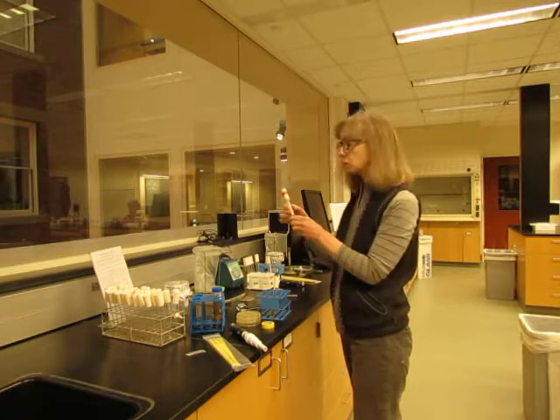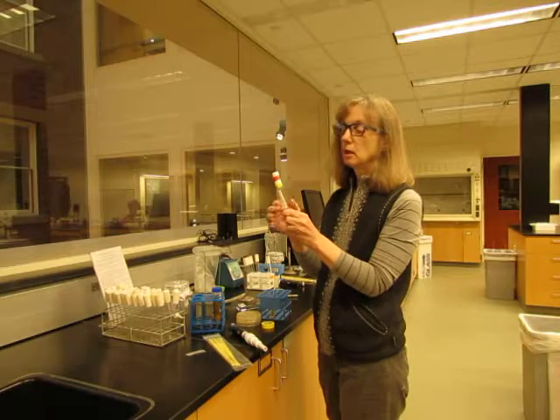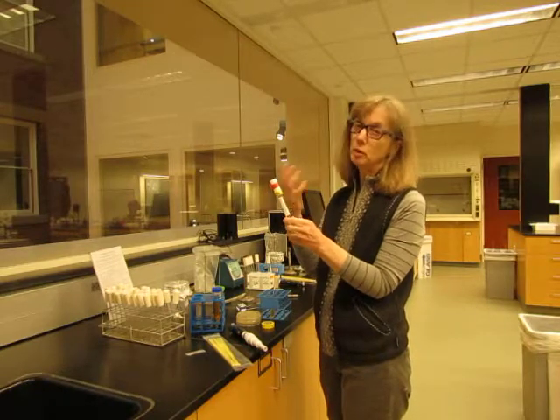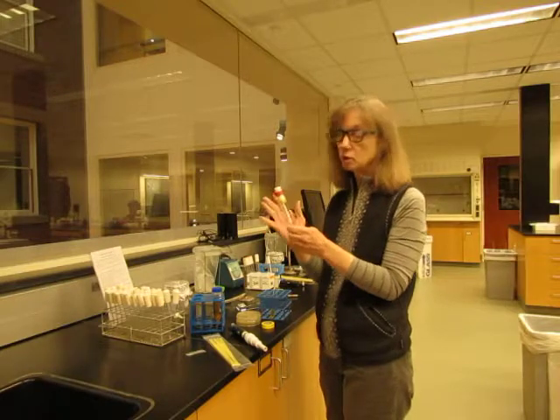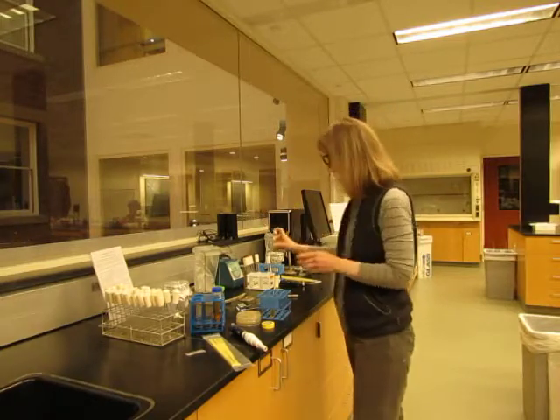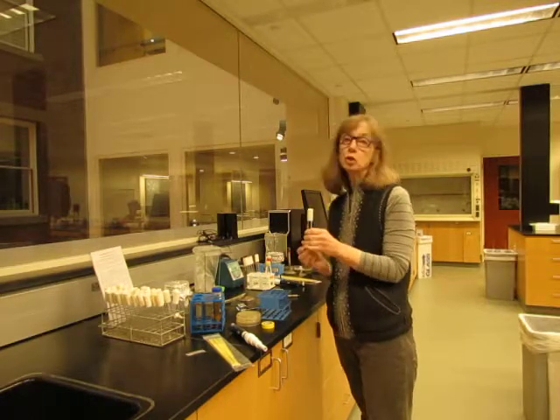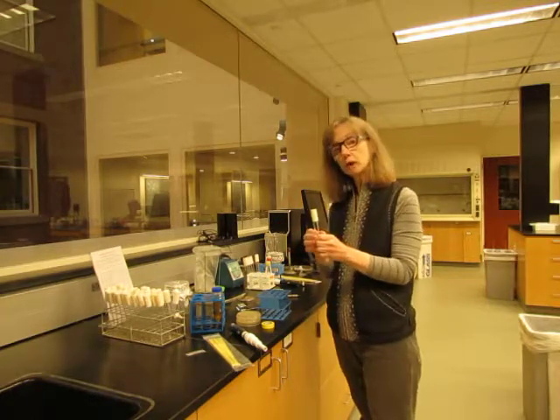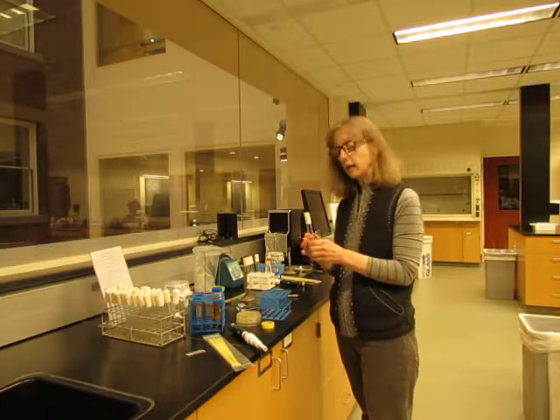One thing you do not want to do is tape the bottom of your top shut, because that will preclude air from getting into your cultures and they won't grow very well. It also uses a lot of tape, which is expensive. So just put a small amount of tape on the top of the culture. At this point the culture is ready to go back to the roller drum, and we will demonstrate how to use that in class.